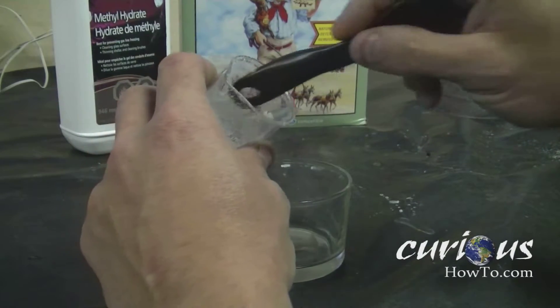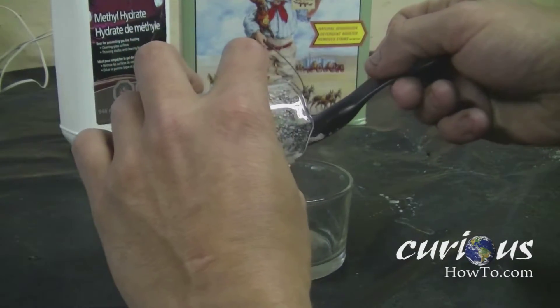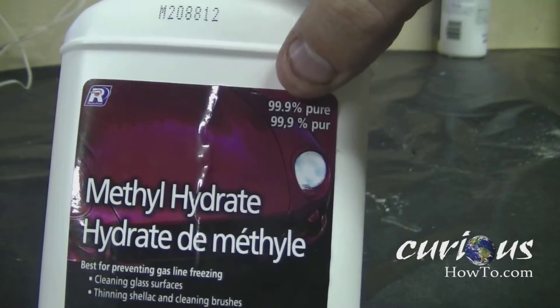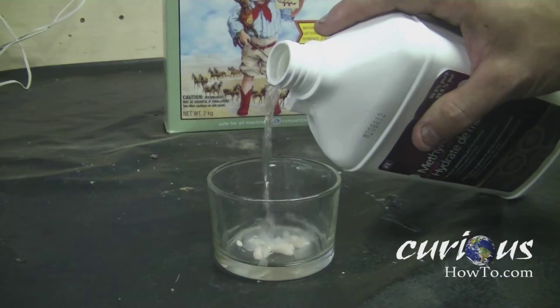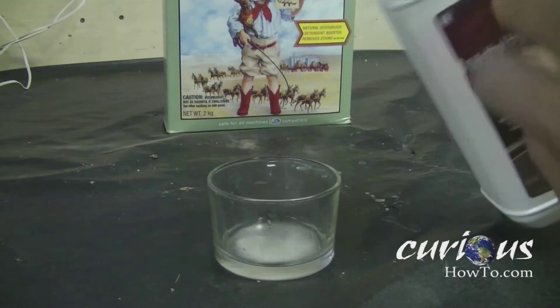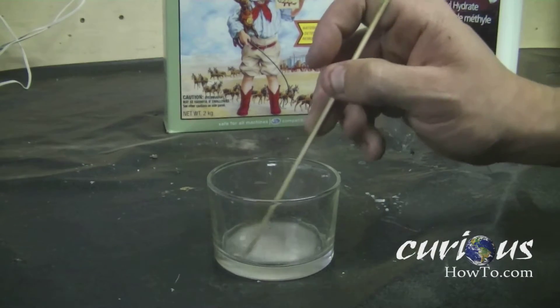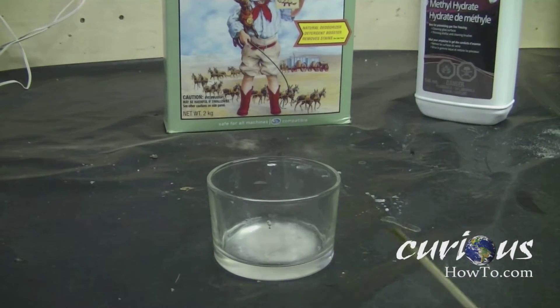Scrape a little bit of the solution into a container, and then you're going to want to add a little bit of methanol, which can be found as methyl hydrate in the paint section of your hardware store. Add enough to cover the top — the more you add, the longer it will burn. Use a stir stick to mix up the solution, making sure it's fairly well mixed and that most of the crystals are soaked in the methanol.